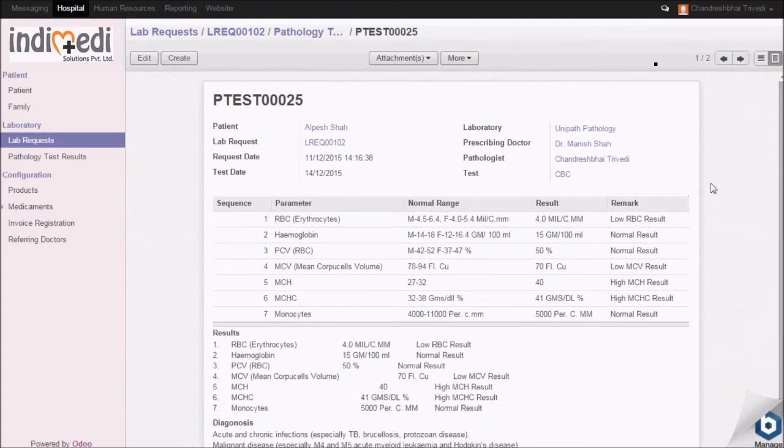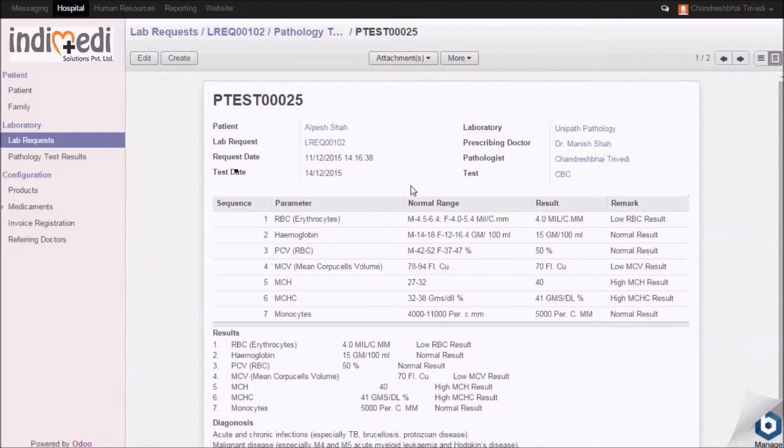For further reference, scan the physical copies of the reports and attach at the respective attachment menu.